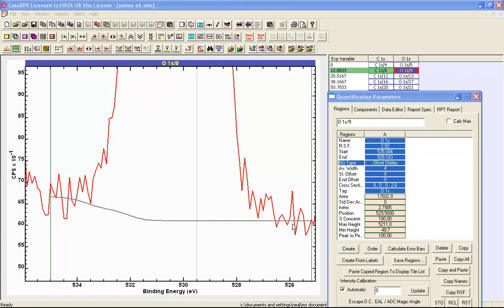The influence of the background on the gold spectrum was much more pronounced than it is for polymethyl methacrylate. Nevertheless, there is some kind of structure here, and it does start to take shape at an offset from the peak, and this offset needs to be modelled, especially when we're looking at the carbon.